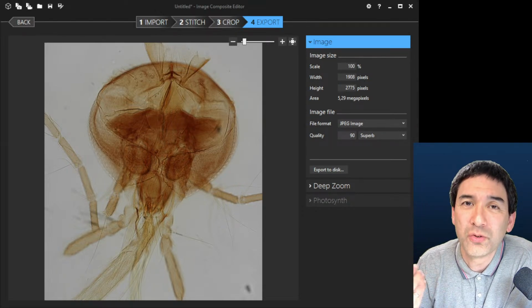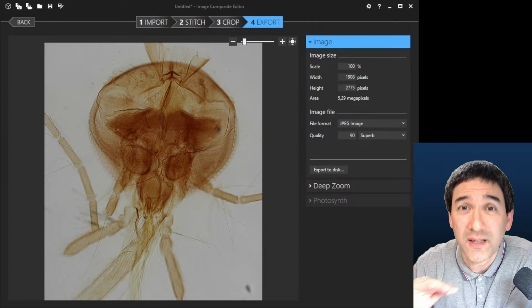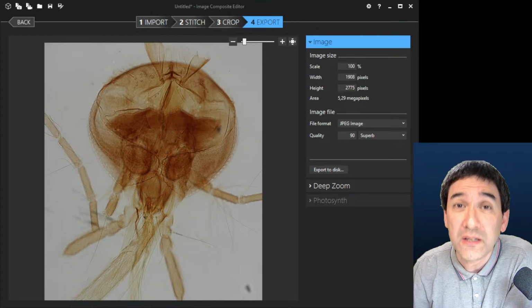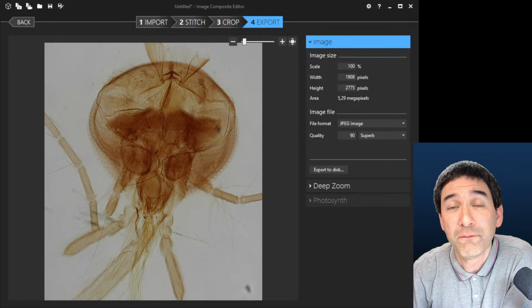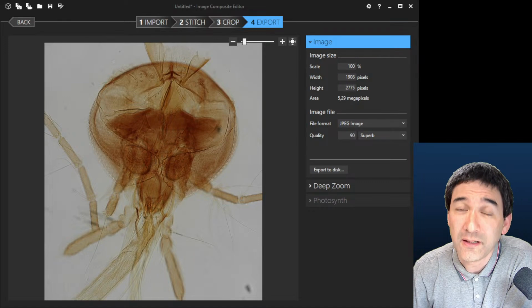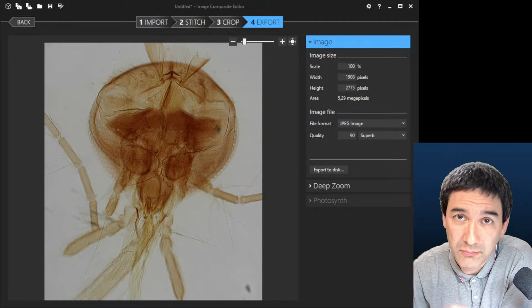Generally, all you need is a 10 times eyepiece that stays. And if you want to go up with the magnification, then you increase the magnification of the objective, because then you're actually also seeing more details. To give you an example, theoretically, you could use a 40 times objective and a 10 times eyepiece, to get 400 times. And then you will see details.